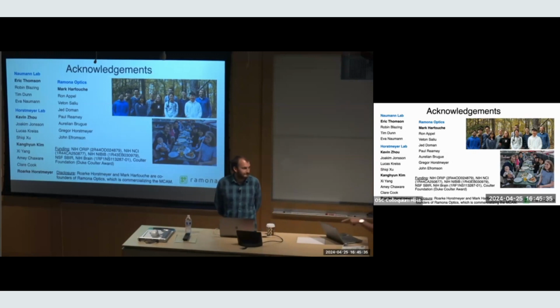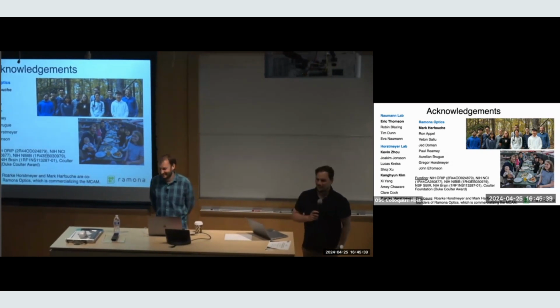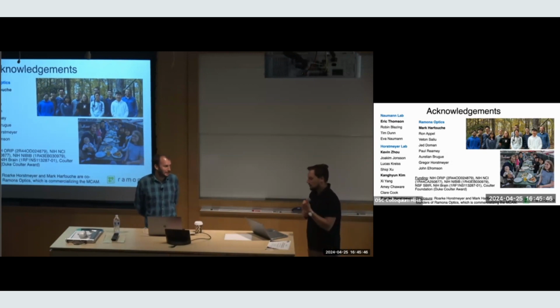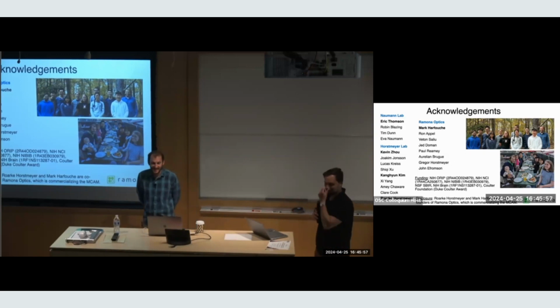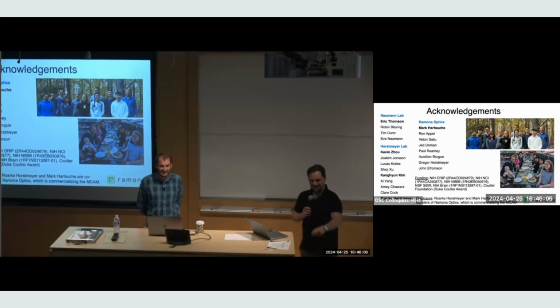I am prioritizing a question from Zoom because I actually have the same question. Structured light. You can do structured light super resolution, for example. You can also exploit the same structured light signal to do 3D imaging. Have you considered using that? Yes. We just don't have time. I haven't had time. I'd love to. It'd be great. It's a very natural fit. I'd love to incorporate some structured light.